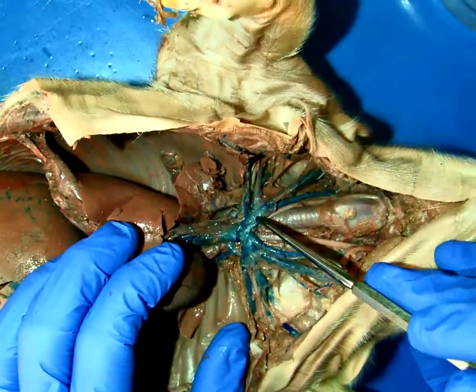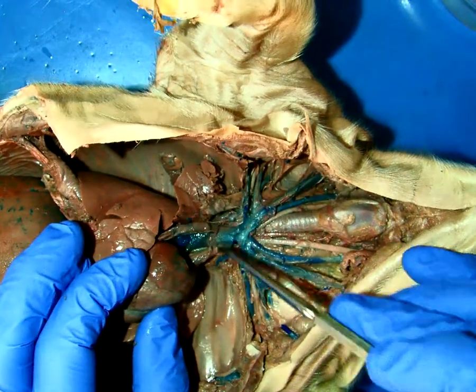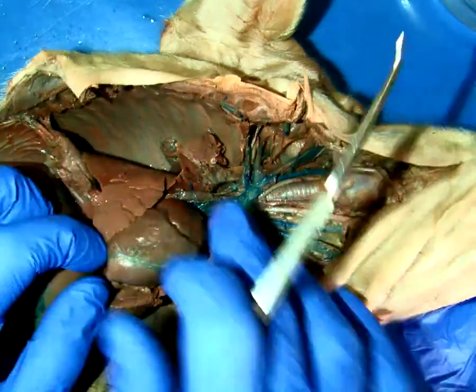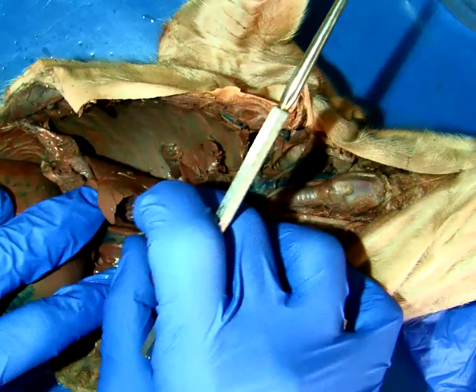And of course, the right and left brachiocephalics join to form the superior vena cava. And then, staying within the thoracic cavity, we can of course see the inferior vena cava.